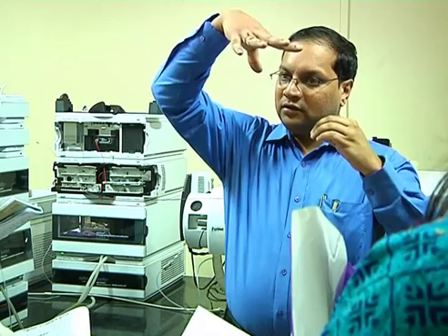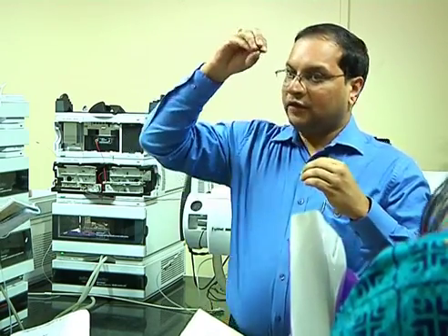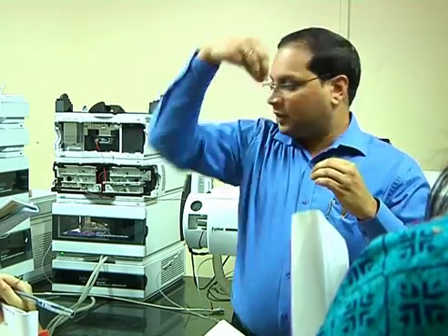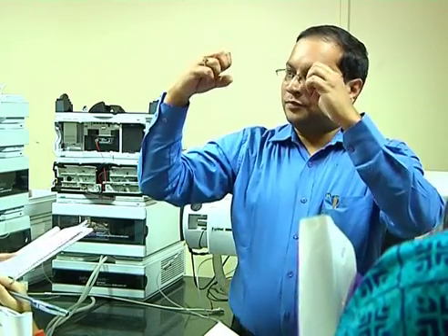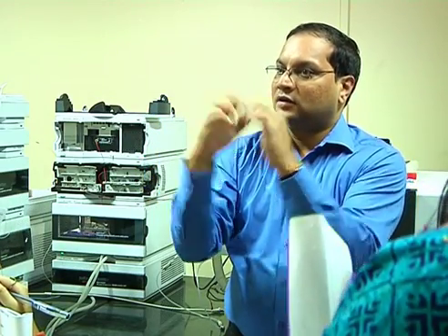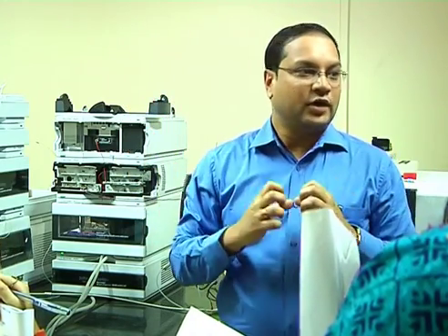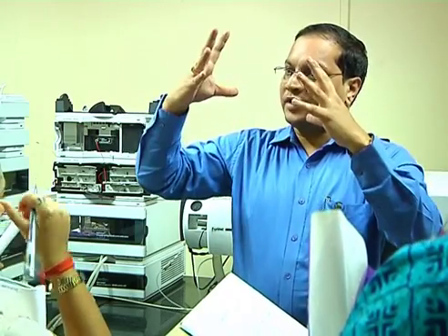When the spray is happening, imagine a droplet of liquid with differently charged peptides inside. It comes out into that high temperature. Acetonitrile will evaporate slowly, and the positive charges come closer. The moment they get closer, they repel and explode. We call it a Coulombic explosion. That is the phenomenon. Many such explosions happen in fractions of seconds, and then everything gets evaporated because of the high temperature.